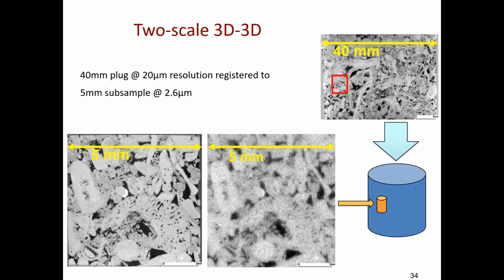Even small shifts happen, sometimes simply because, in the X-ray setup, there's a rotation happening. You're counting on that plate to mechanically rotate back precisely to the same position after it has done a full circle. Well, it does that with a certain precision. It's a mechanical device. It's not necessarily perfect.